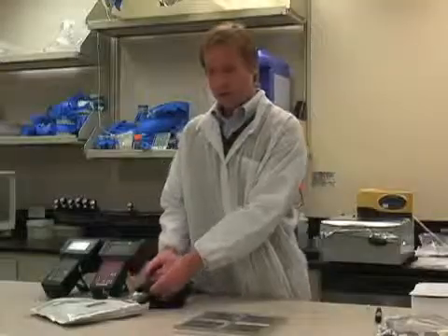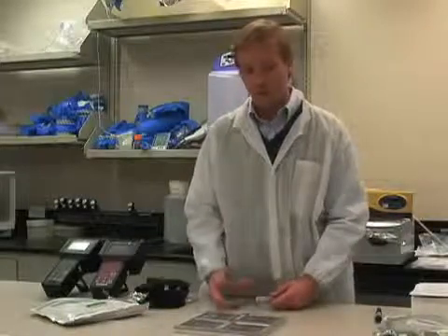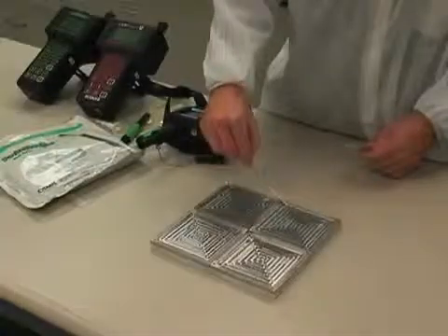Next, I'm going to take the retrofit adapter and insert it back into the Charm machine. Next thing you want to do is do the same thing with the Snapshot swab. But you don't want to swab the exact same surface that you swabbed with the Pocket Swab. What you want to do is swab an area that's very close to it, similar in size, but not going over the same area that you just swabbed. So in this case, I'm going to swab this square.